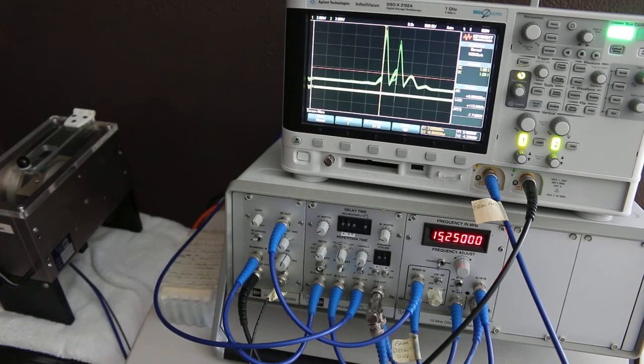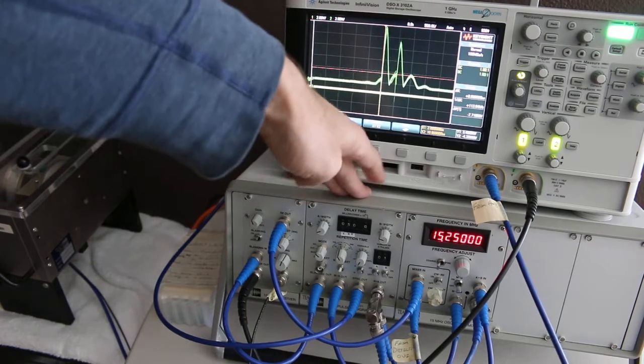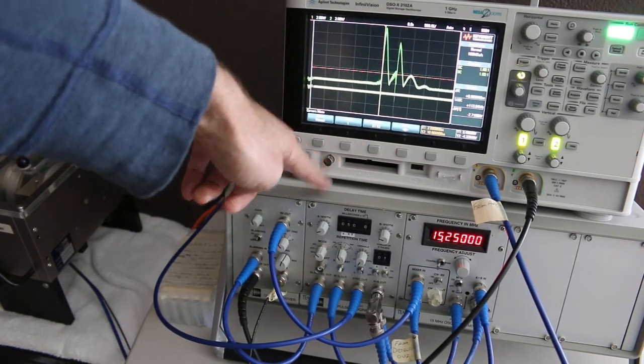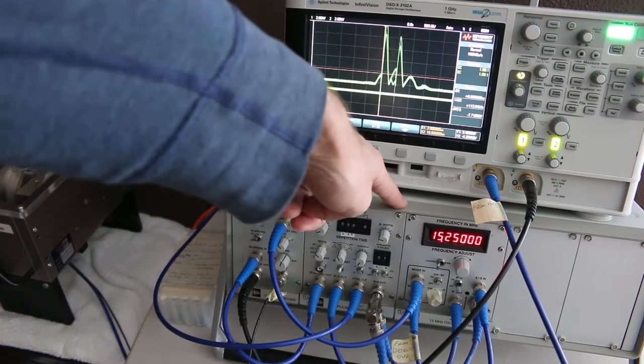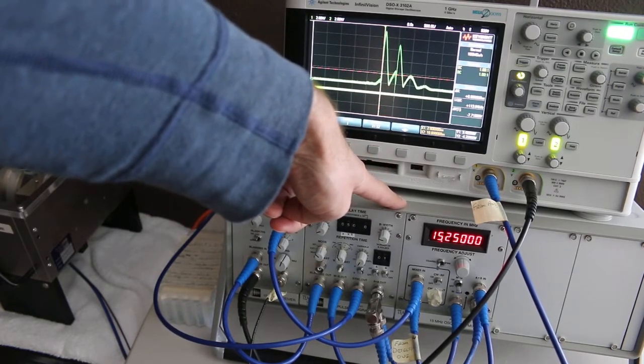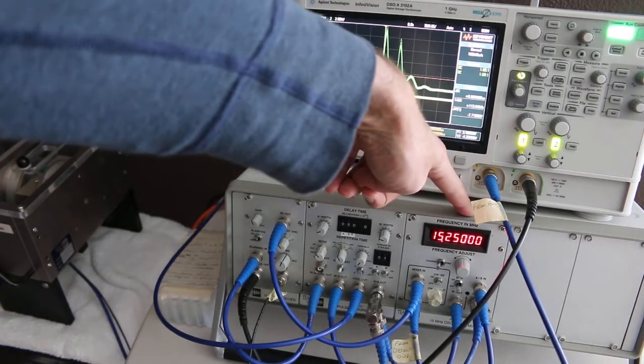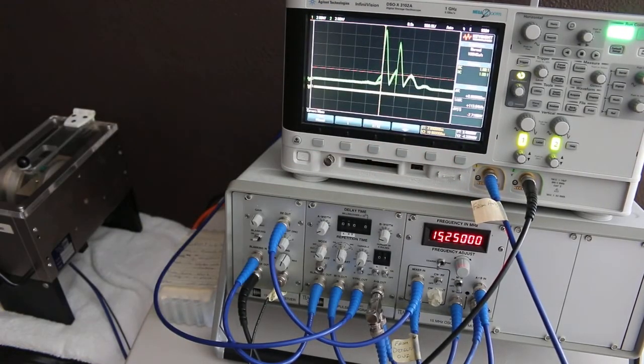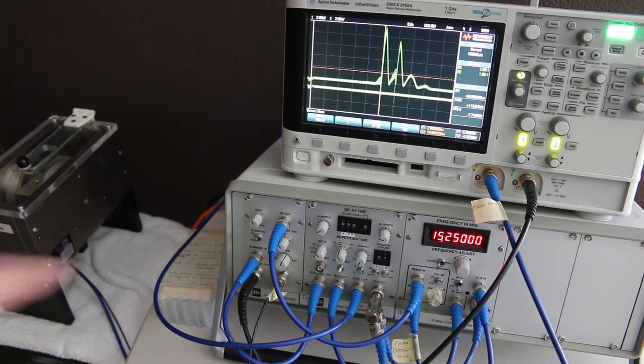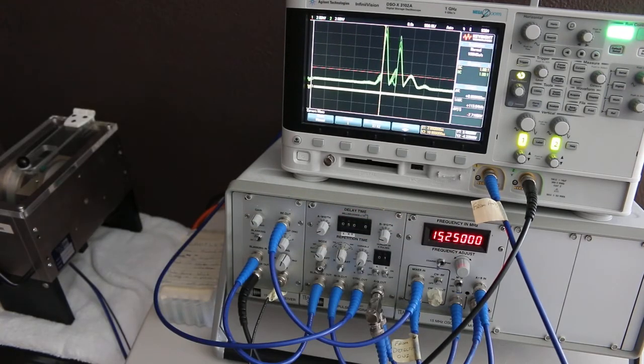But essentially, it's a pulse programmer that, as the name implies, allows you to sort of program a sequence of pulses that will come out of this unit. Again, it'll always start with one A pulse, and then you can have from one or more B pulses coming out. And what the pulses will do, they connect directly over here to the frequency generator that tells the frequency generator when to turn on the RF at the frequency as advertised.